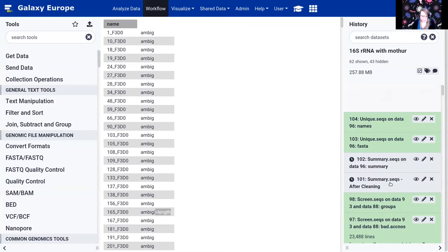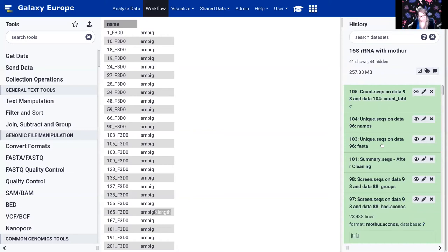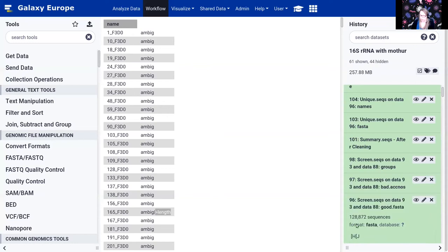After cleaning we do another summary.seqs. The unique.seqs tool has already taken all our cleaned FASTA reads and identified duplicates. If you click on unique.seqs you can see the number of sequences — 16,426 unique sequences, down from 128,000, so the vast majority are duplicates. This is expected since we're sequencing many of the same organisms, which will have the same 16S V4 region.